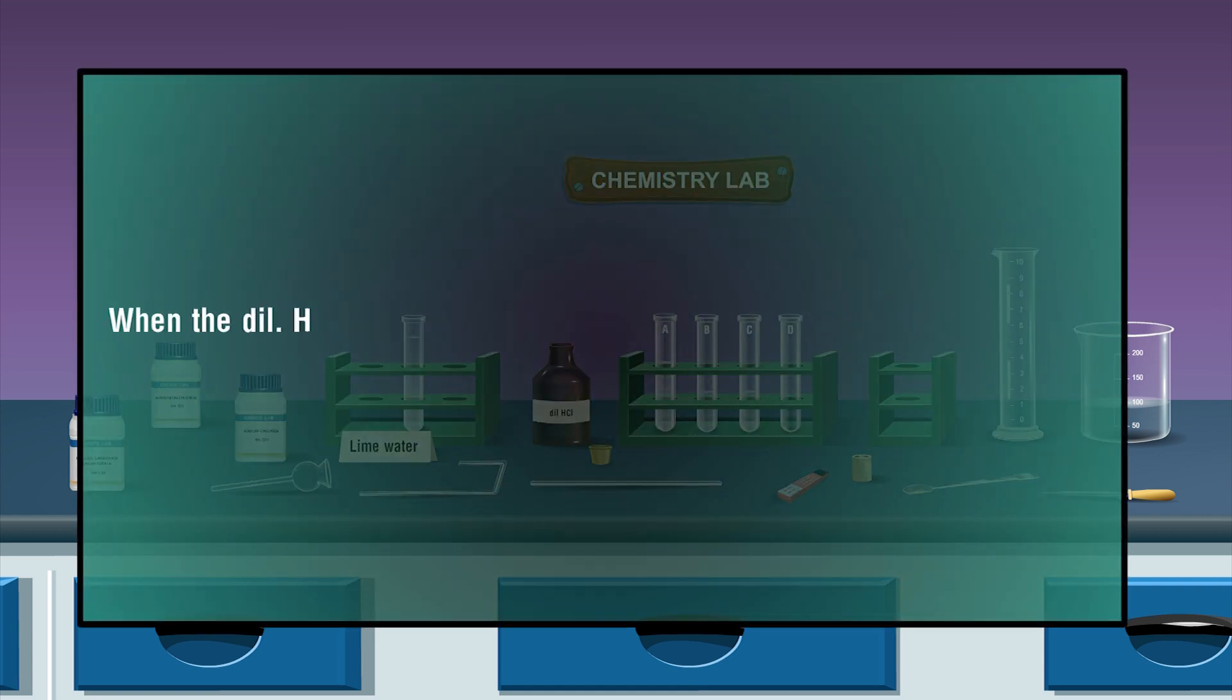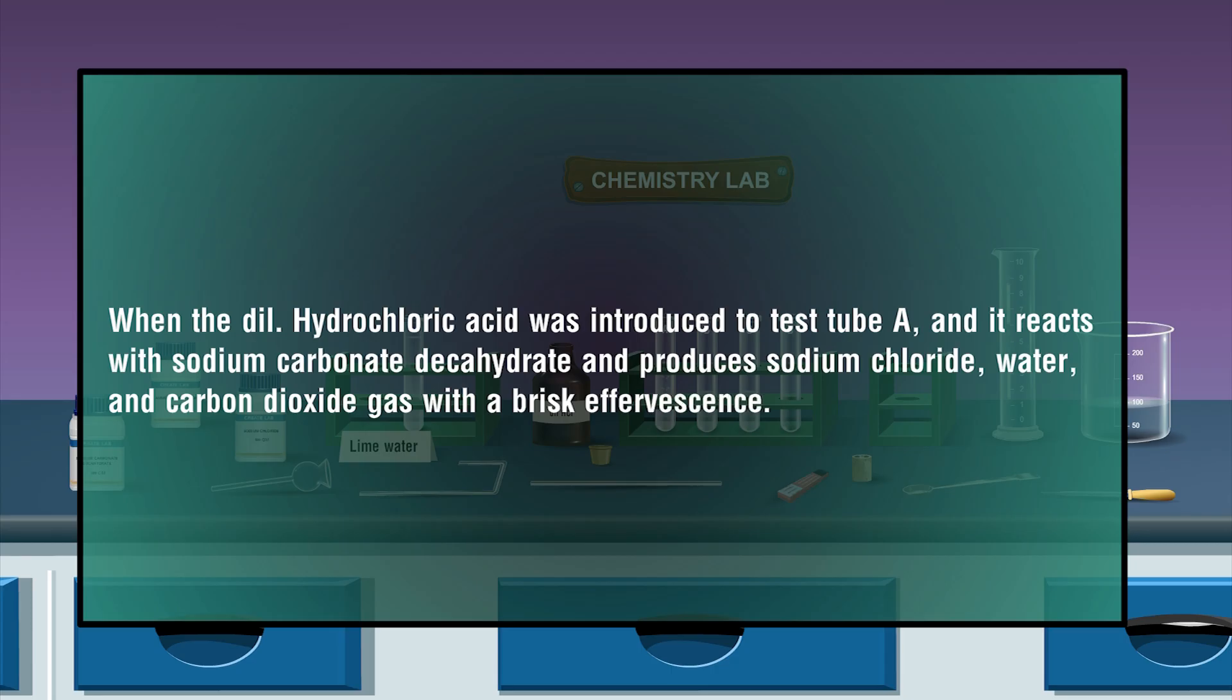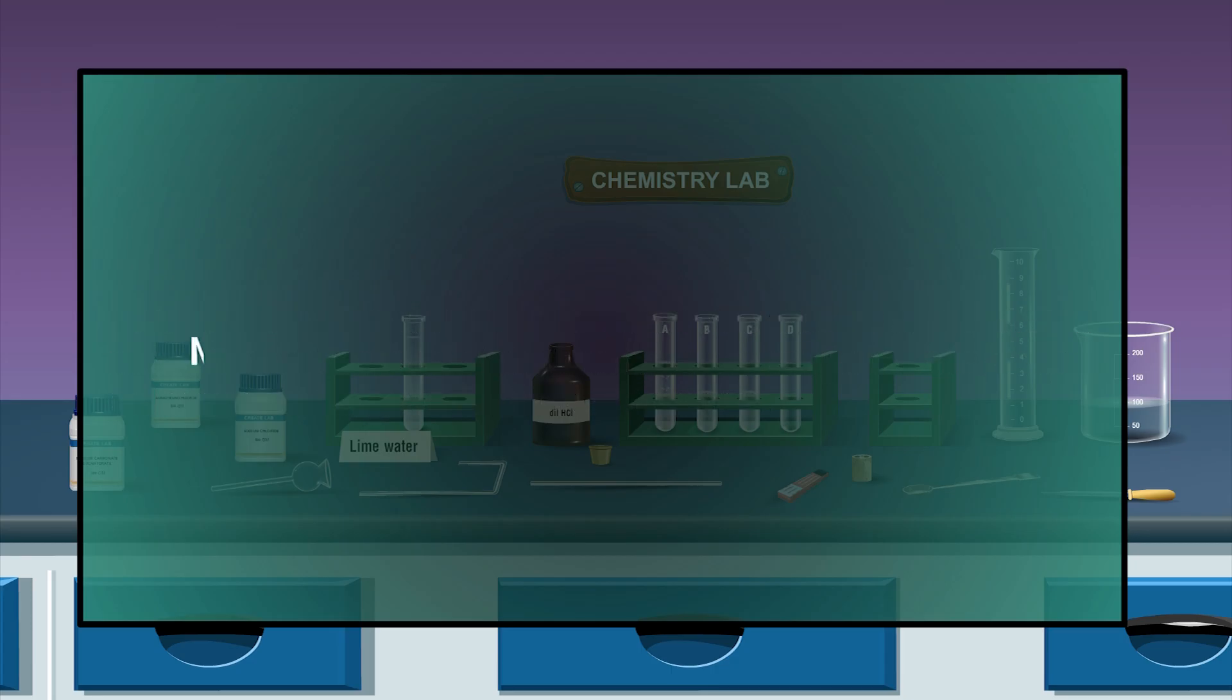When the dilute hydrochloric acid was introduced to test tube A, it reacts with sodium carbonate decahydrate and produces sodium chloride, water, and carbon dioxide gas with a brisk effervescence. Na2CO3 solid plus 2 HCl aqueous gives 2 NaCl aqueous plus CO2 gas plus H2O liquid.